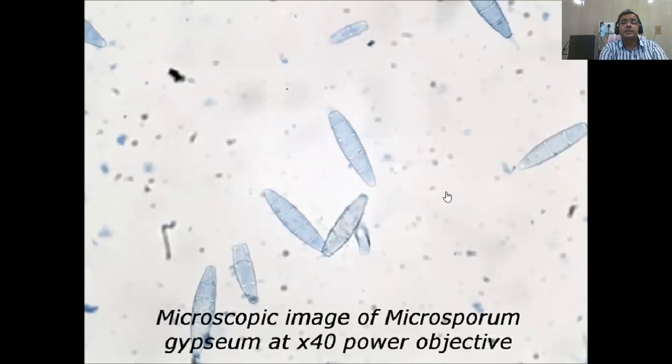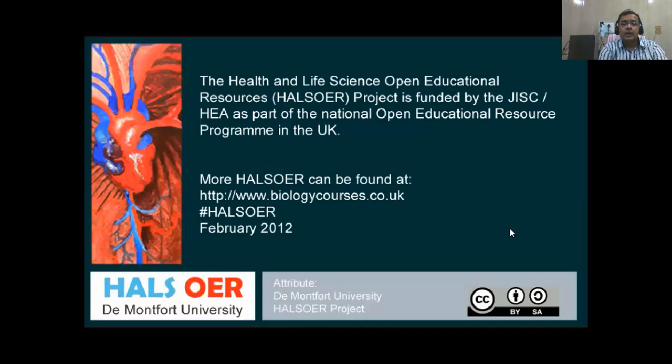So this is the video by which I tried to explain how we can perform lactophenol cotton blue staining. Now moving to the next one, how we can see, once you observe under the microscope, how the veterinary important fungi will look, because we can classify them based on their morphology.